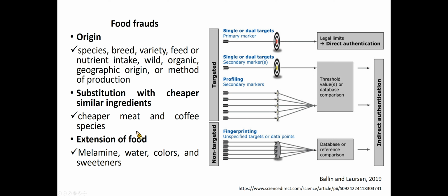This highlights the large variation in food authenticity issues and indicates that evaluations of a single analytical parameter, either chemical or biological, is often insufficient to reliably verify the authenticity of a product across these categories and different food commodities. More recently, advanced analytical approaches such as profiling and fingerprinting, accompanied by multivariate statistics or chemometrics, have shown potential in this respect.